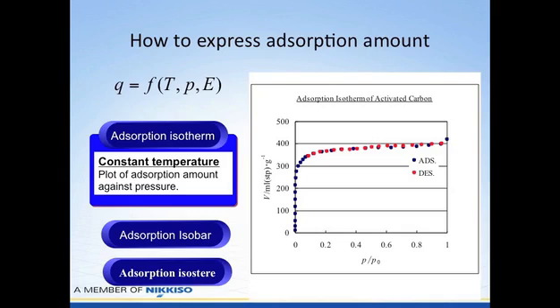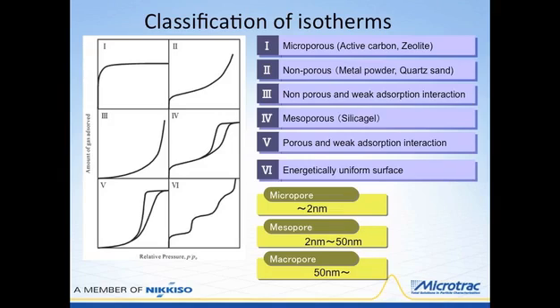And then if we continue with desorption, we'll follow this path back here. And you'll notice that these two curves are superimposed. And under these conditions of a highly microporous material, that is pretty much what will happen. Now, I mentioned the concept of an isotherm, and what I just showed you is indicative of what's called a type 1 isotherm.